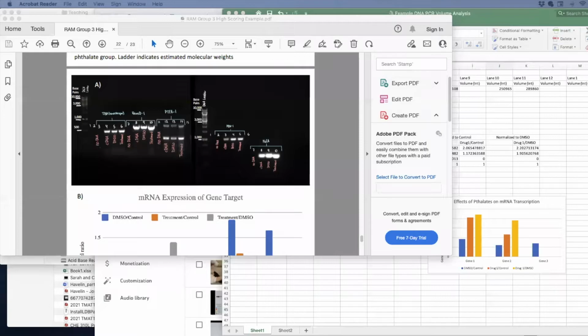Record on this computer. It says it's recording, so I suppose here we go. I'll share the screen that I'm working on. Okay, I think this is working. Everyone's still here. You guys can see this.